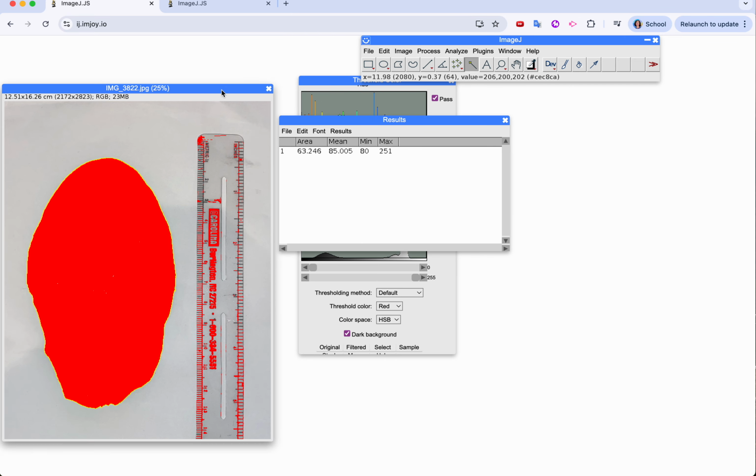I actually haven't tried to do this for a bunch of leaves. You might just be able to line up all your leaves at the same time, and just select them separately and analyze them separately. I might have a different video that I can show you. But I would just make sure that you take a picture of your leaf and write the name of the leaf, like, is this trial 1 of whatever, which will be really helpful when you're trying to get this later on. So I would take a picture of your leaf first, then stick it in the chamber, do your test.